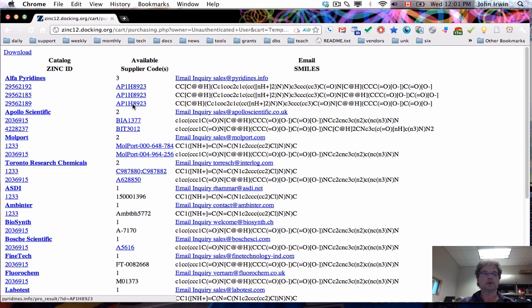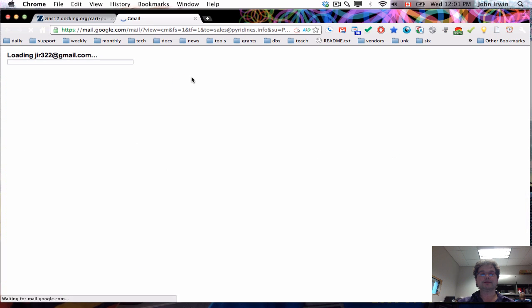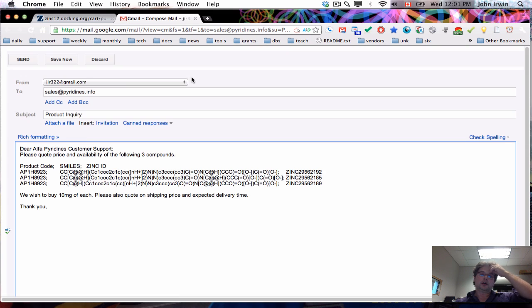Now we're going to click on the purchaseability report and you can see that the company called Alpha Pyridines actually sells three of those six molecules. If you want to purchase them here are the SMILES, here are the codes, but you can simply click on this link and it will compose an email message for you so that you can inquire about the price and availability of those compounds and all you need to do is click send.